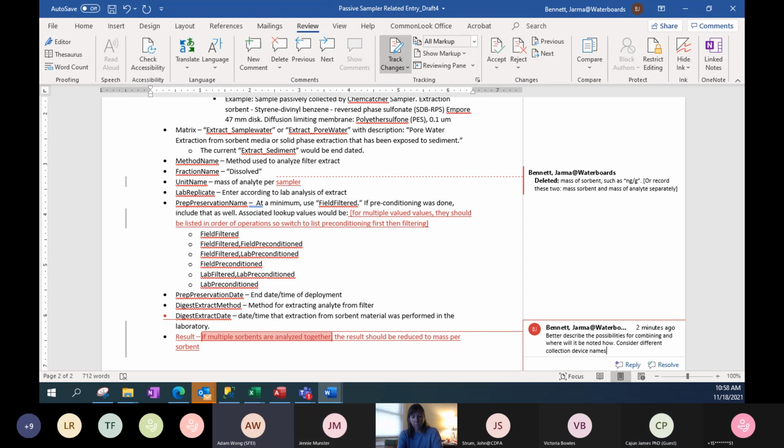The difference between 1 47 millimeter disc and 3 47 millimeter discs seems the same general idea, versus messing around with replicates, but maybe that's wrong, because I haven't dealt enough with these.